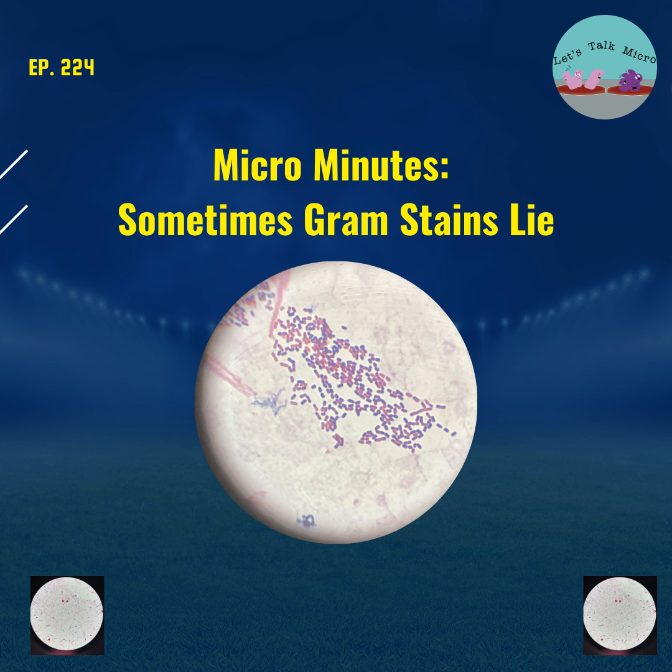And of course, when it comes to staining, I always like to tell people to keep an eye on Acinetobacter, right? That's one that you see that sometimes new techs call gram-positive cocci because they do like to retain that purple stain sometimes. And maybe you can repeat the slide and you can still get the same result. However, Acinetobacter, yes, they are plump coccobacilli, but they are larger than cocci and they don't have that cluster or chain arrangement.